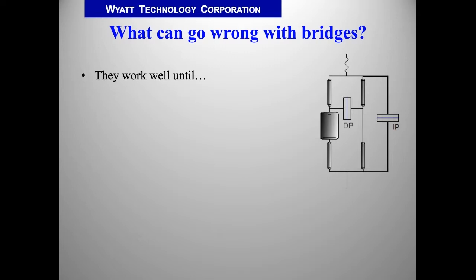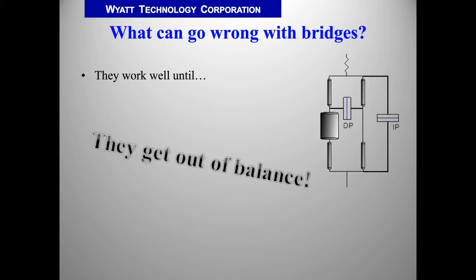So bridges work really well so long as they remain in balance. The problem is they can get out of balance. And we know when bridges get out of balance, bad things can happen.